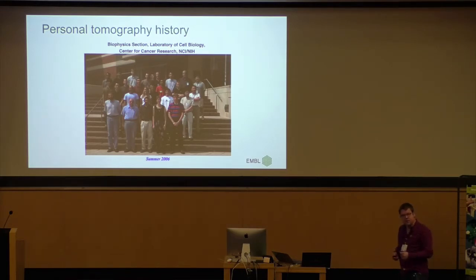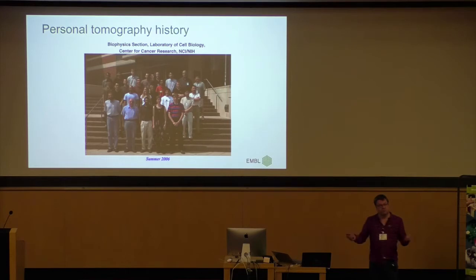I did this together with Andreas Vogt, who at the time was writing the tomography software. So we just went back and forth. It was just one developer and me. I just told him what I wanted. The next day I got a new version. And that's how we got batch tomography running. And at the time, Sriram was working on this HIV stuff. That's why I needed automated tomography, which was very important.